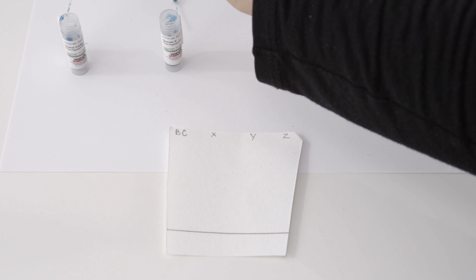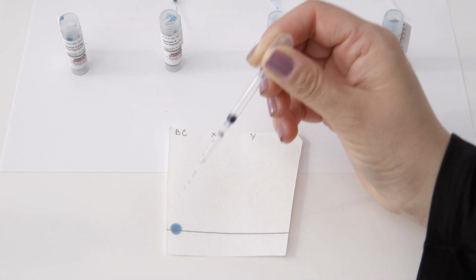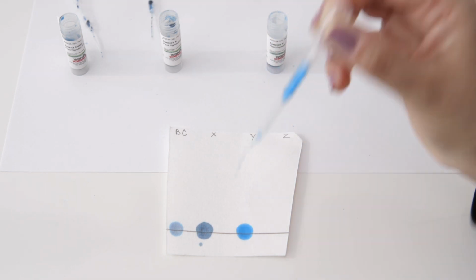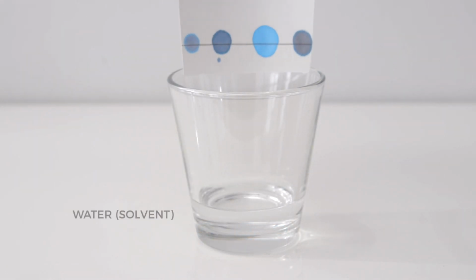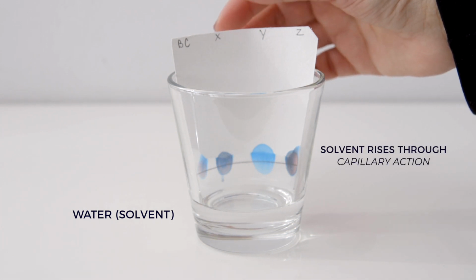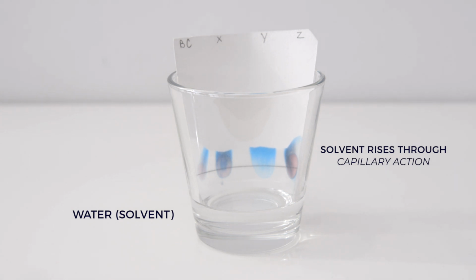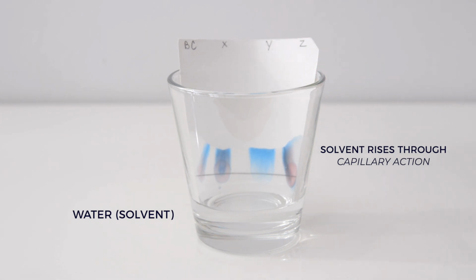Using a clean microtip dropper for each plant extract, place 1 drop of each pigment at the line, at their corresponding location. Then place the filter paper in a cup of water. As the solvent rises on the paper, it meets the sample of mixtures and carries the components of mixtures along with it. Along the way, the various components of the mixtures are separated out at different levels on the paper.